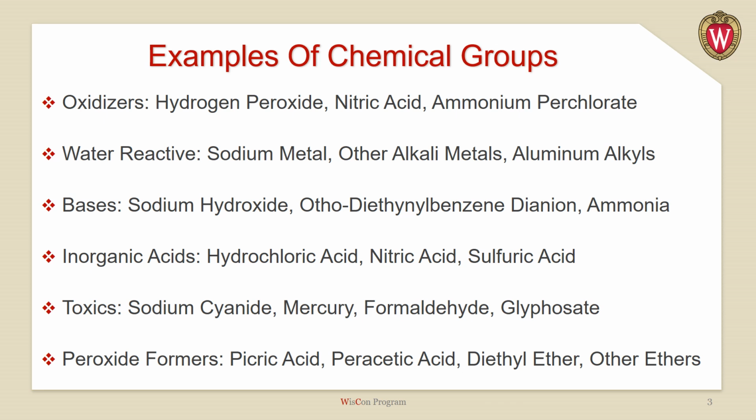Inorganic acids: hydrochloric acid, nitric acid, sulfuric acid. Toxics: sodium cyanide, mercury, formaldehyde, glyphosate. Peroxide formers: picric acid, peracetic acid, diethyl ether, other ethers.